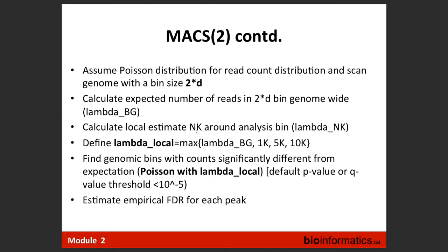What it suggests to me is that if we really have to reduce the p-value that strongly in order to get a reasonable amount of enrichment, it means my statistical model was not that precise. But it's still a good quantity, because we rank our locations according to this p-value, and we can choose ourselves what threshold to use. That's what everybody is doing. As soon as we describe what we do, that's okay.